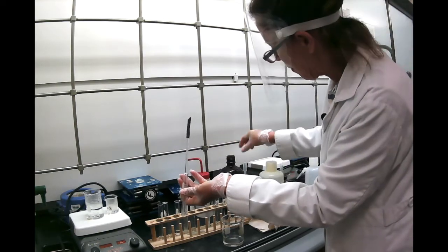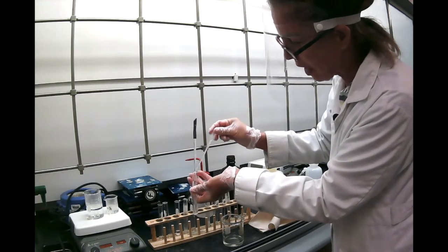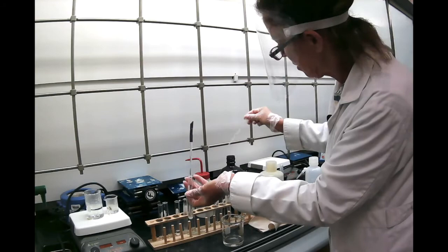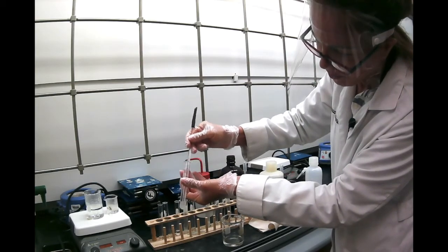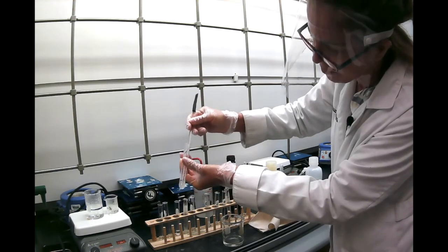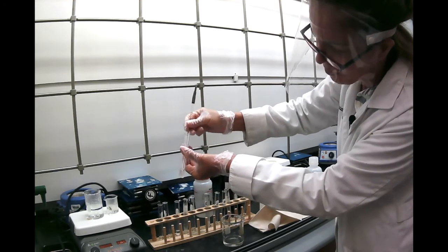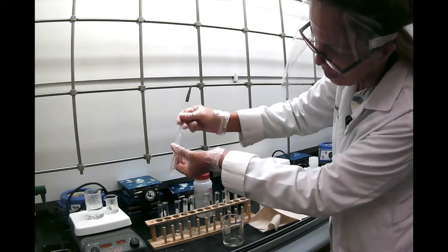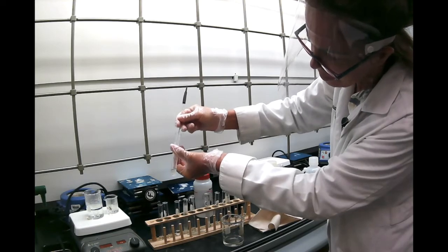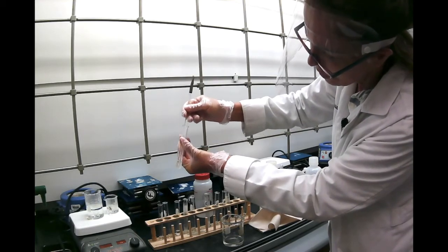Now, one problem with petroleum ether is it has the tendency to evaporate quickly, so I'm going to add a little bit more before it evaporates. So we can say that it's slightly soluble. It's not completely insoluble. It looks like it is dissolving, but not completely.